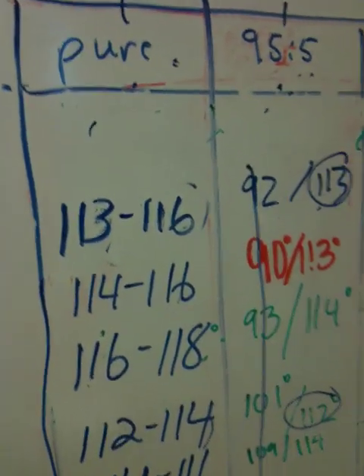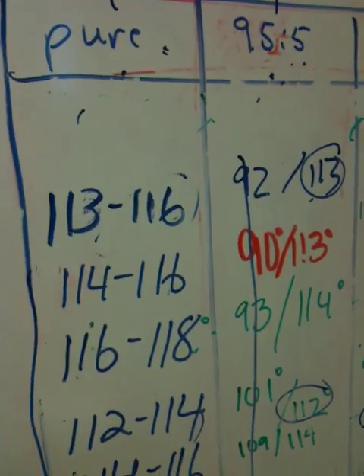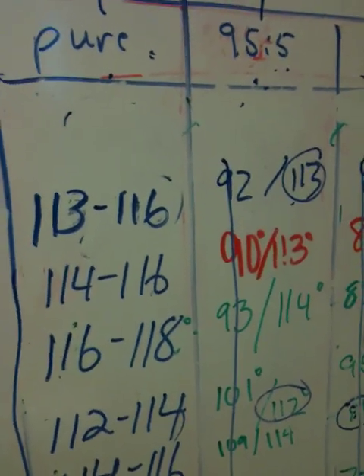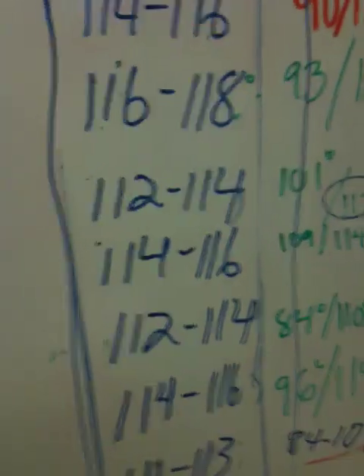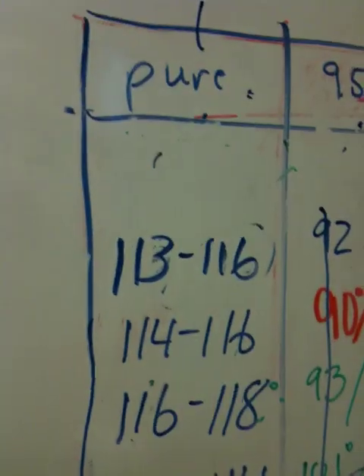Hi, as I promised, I would give you a little review of the conference, and it's just a little review. It's only going to be about 5 minutes long, I hope. What I had to do during the review, if you will recall, is I had to record your data. These are the melting points of various pure samples. I actually had to make those up because I had erased this section.